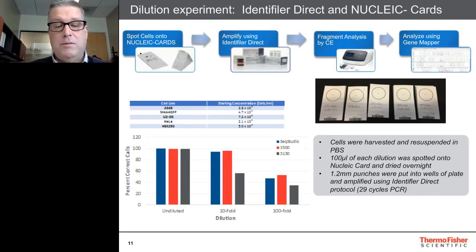We also recommend doing a PCR cycle number test to make sure that you are within the range and not producing out-of-range errors, by using between 27 and 29 cycles of PCR.